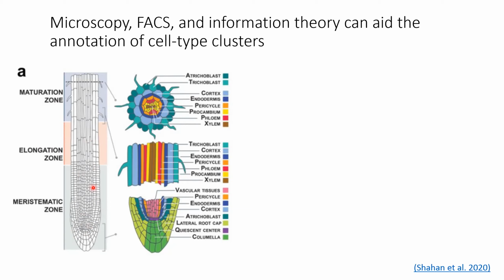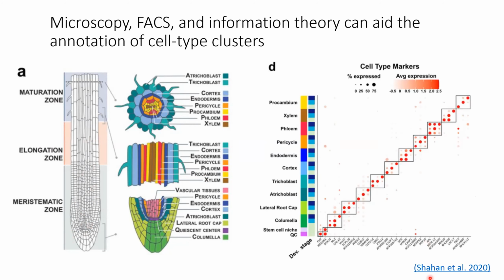with different physiologies. So the authors combined previous data to find a set of defined marker genes, and then explored how their single-cell RNA-seq clusters corresponded with the orthogonally generated knowledge of marker gene expression.